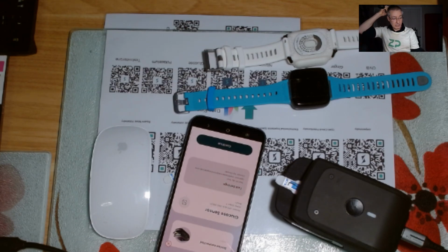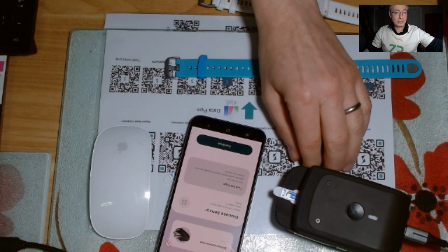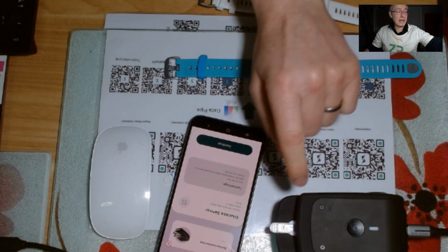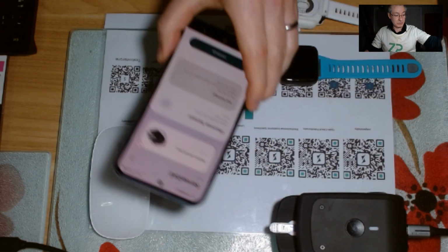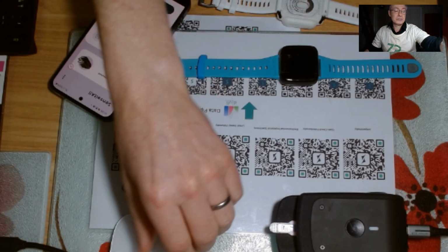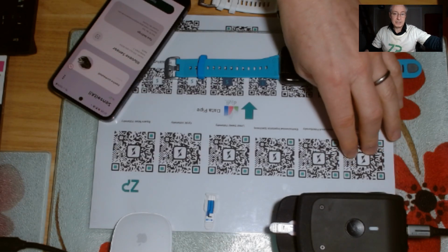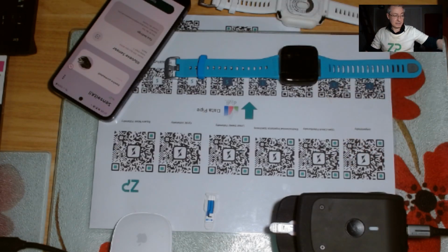And we're basically functionalizing those electrodes, and then we're driving those electrodes by a series of techniques. The most classic technique used in electrochemical biosensors is amperometry. So it's quite easy to say that amperometry is very widely used.